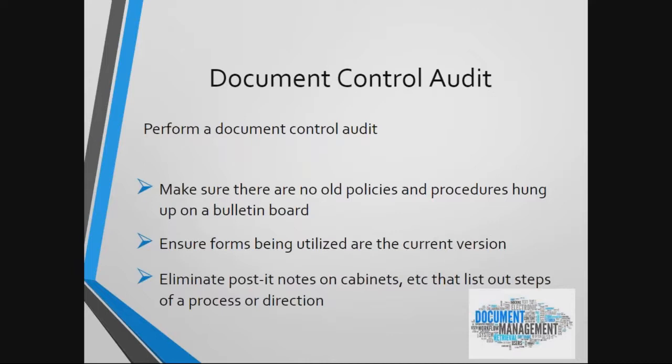And I look for things like policies posted on bulletin boards or walls, taped to walls, post-it notes, cheat sheets, and then I look at the forms that are being utilized throughout the department. Generally speaking, when I find documents of this type, in particular the posted policies and any cheat sheets, I will ask the leadership team to remove them and discard. The reason I do this is that these sorts of employee-created tools often lead staff to do things that are not in line with the documented policy, or it appears as if they do.